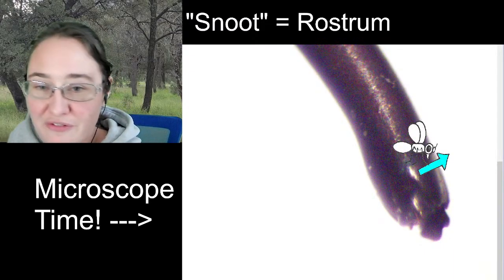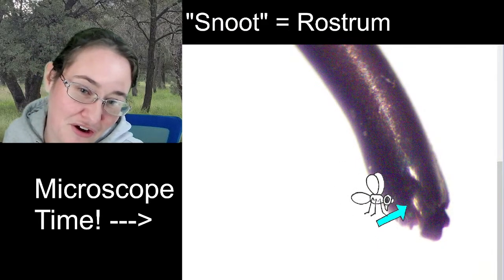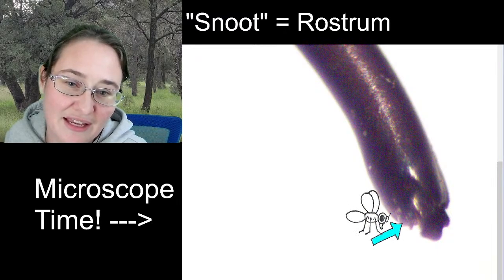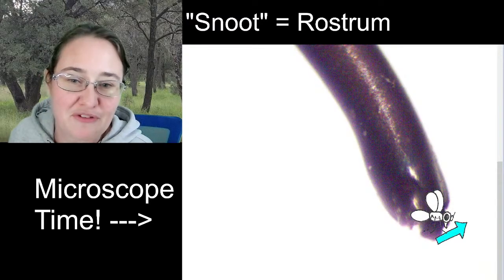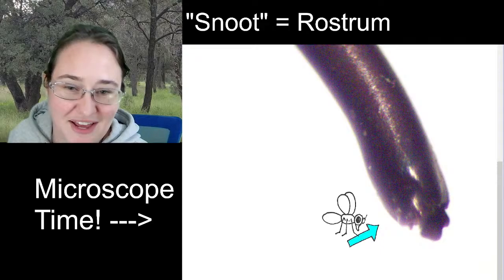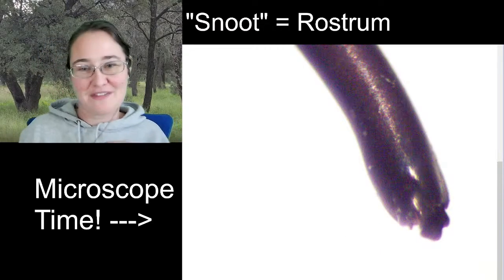So if we look right about here, this is the right one. It hooks down. You can kind of see it in the light. And then it's got the sharp part of its mandibles right here up in the front. And then this is the far one curling in towards us. So I think that is pretty nifty on this specimen.